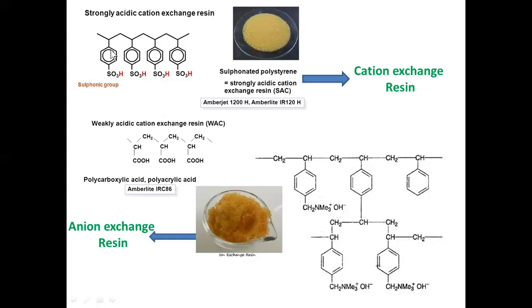So when you make this resin contact any aqueous solvent, this sulfonic acid undergoes dissociation or hydrolysis or ionization to get converted to SO3 minus and H plus. So this is going to be the resin. SO3 minus is the anionic group which is attached to the polymeric surface, and H plus ion is going to be the positively charged species which will be moving in nature.